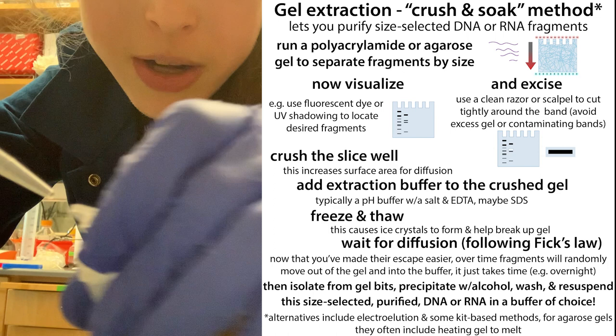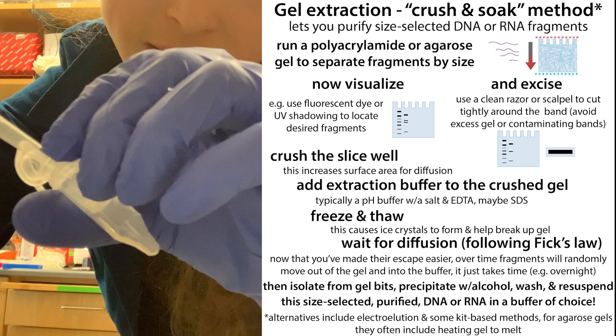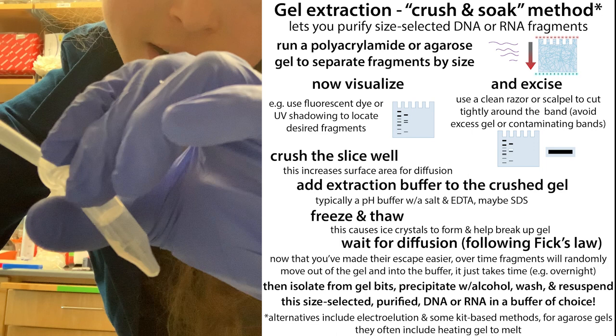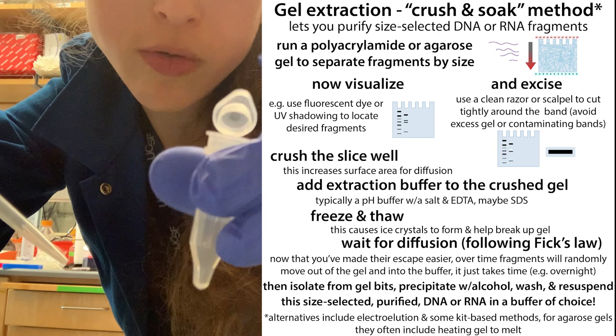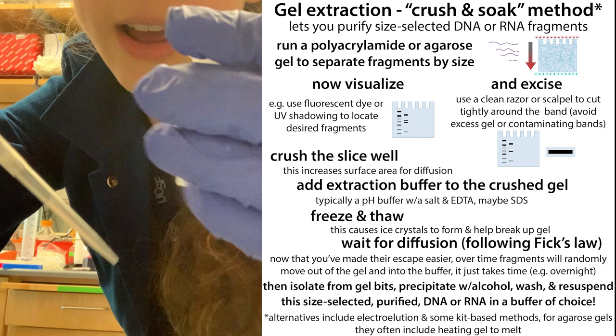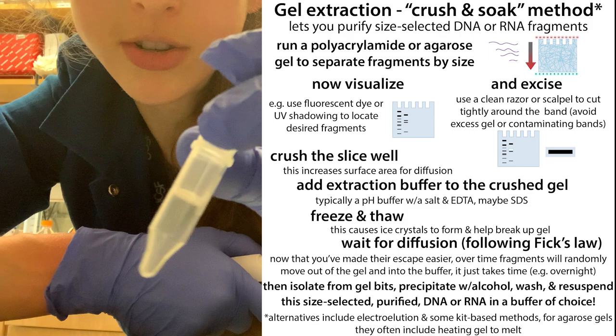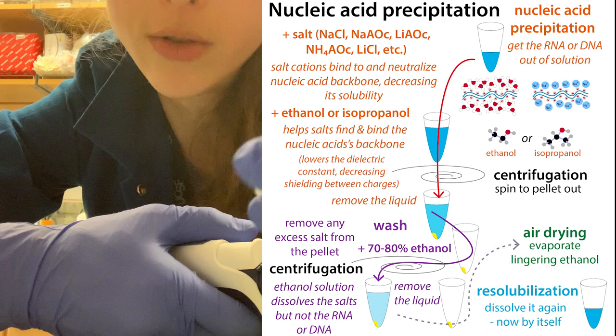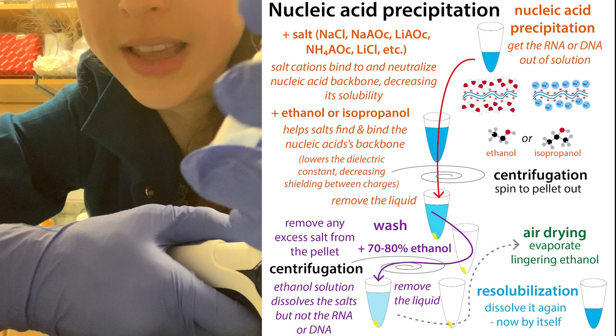If a drop gets stuck on the side of the tube, carefully hold your thumb down on the plunger before inserting the tip, then slowly release to pull up liquid until you reach that drop and carry it back down. Go really slowly to avoid liquid jumping up the sides of the tip — some extraction buffers are more prone to this than others. Once your sample is all in the spin-column bucket, centrifuge for about a minute to pull the liquid through. The gel bits get trapped and you can proceed to precipitation — typically adding glycoblue co-precipitant and ethanol to precipitate out the nucleic acids and purify the pellet.